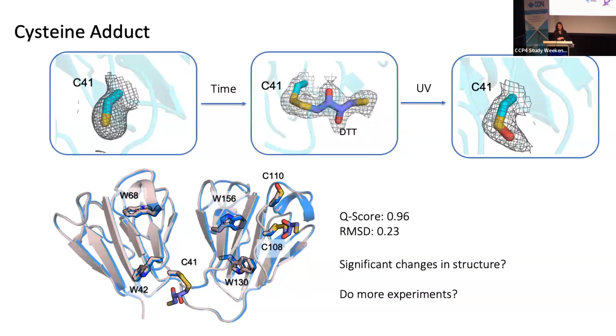We think they're quite interesting, but is there anything else happening to the rest of the protein? Because it's quite important that the protein remains in its structural form in order for the chaperone protein to be able to bind to it and do its job, help it to remain stable. But I was thinking, well, it doesn't look like there are any significant changes in the structure.